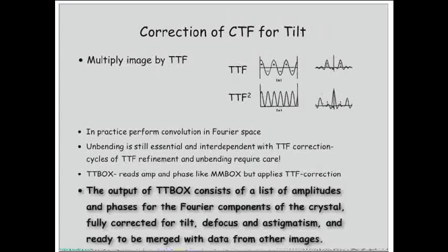If you don't get it right, you can end up getting stuck with the wrong defocus and astigmatism. So you've got to make sure that you're within roughly the correct defocus and astigmatism to start with, let's say 1,000 angstroms. If you're too far out, you may end up locking yourself into a false minimum, which you won't get out of.